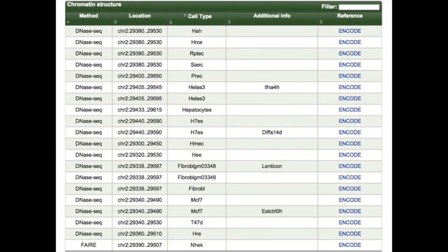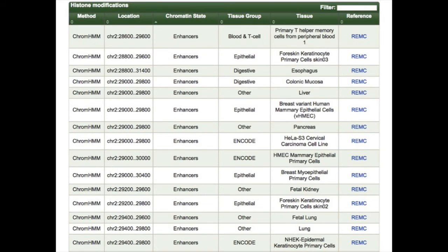There's also a table for chromatin structure, where you'll find DNase-seq and in some cases FAIRE-seq information, with cell type information, the original source of the data, and any additional information such as chemicals added for the assay. Finally, you'll have histone modification data with ChromHMM annotations, showing the predicted regulatory state and the tissue type this state is predicted in — all from Roadmap data. For example, this variant is in an enhancer predicted in the esophagus.